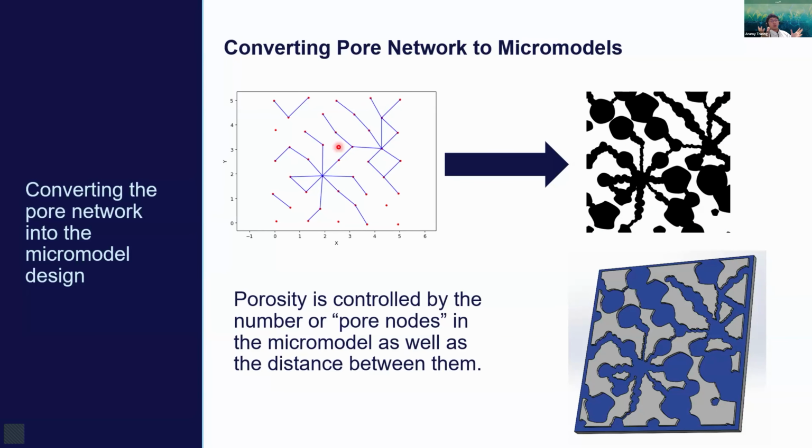And vice versa, if you decrease your size, your porosity is going to increase because now your pores are coming closer together, it's more dense. So while there's no parameter that says, hey, I want 45% porosity in this network, you can use our algorithms to manipulate the geometry in a way that will be most representative of your soil core.